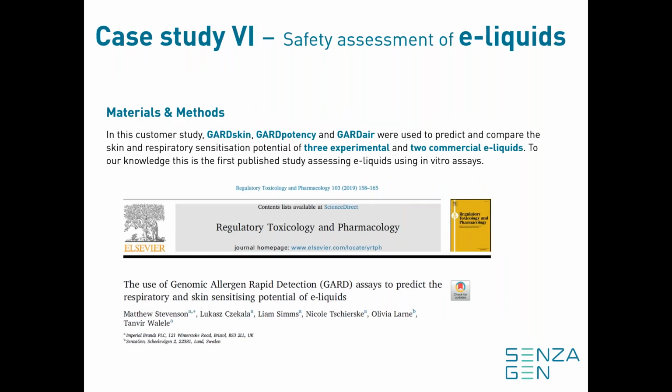So by that, I would also like to show you the last case study in today's webinar, which describes how we use a combination of the GARD skin assay, the GARD potency assay, and the GARD air assay to predict the skin and respiratory sensitization potential of e-liquids.